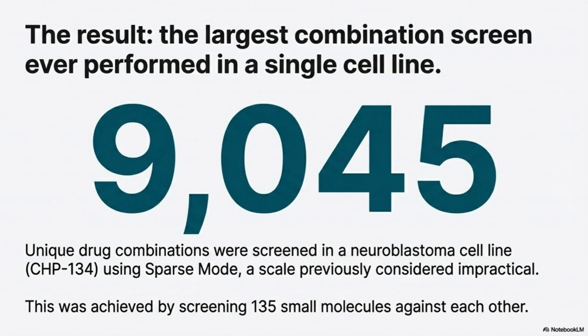Of course, when you're relying this much on inference, validation becomes the most important part of the story. How do we know these reconstructed matrices aren't just computational fantasy? They built a really solid foundation for it. They used the dense mode to generate this massive high-quality reference dataset, 806 combinations, over 290,000 measurements. And they showed the assay quality was strong, with a mean Z-prime score of 0.747.